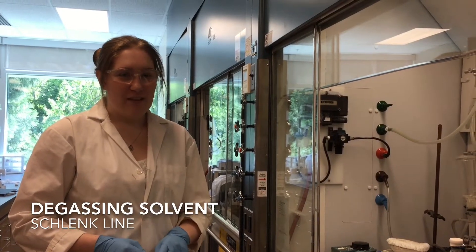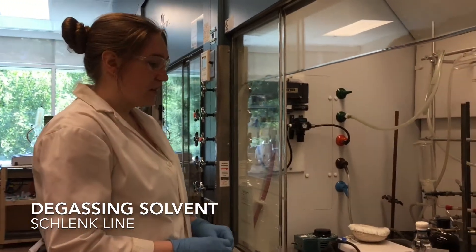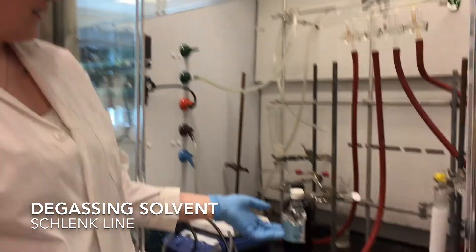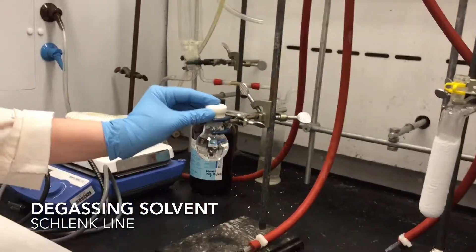Hello, today I will be teaching you how to de-gas solvent by bubbling nitrogen through it. What you're going to need is a flask, a solvent of your choice — in this case we're using ethanol — and a septa to go on top.